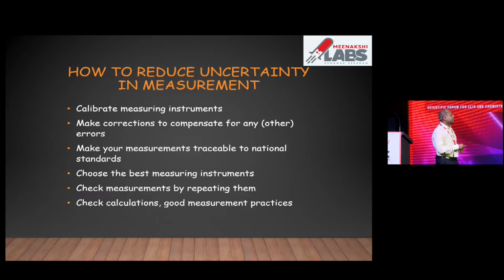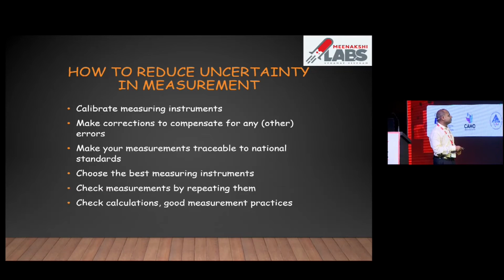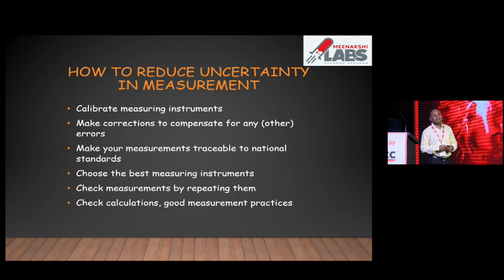Make corrections to compensate for any other errors. Make your measurements traceable to national standards. Choose the best measurement instrument. Check measurements by repeating them. Check calculations and follow good measurement practices. So these are some of the areas where you can reduce the measurement uncertainty.